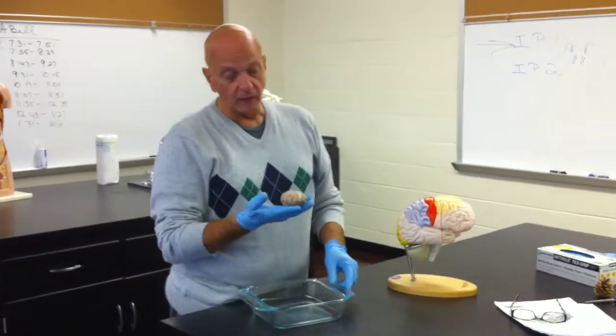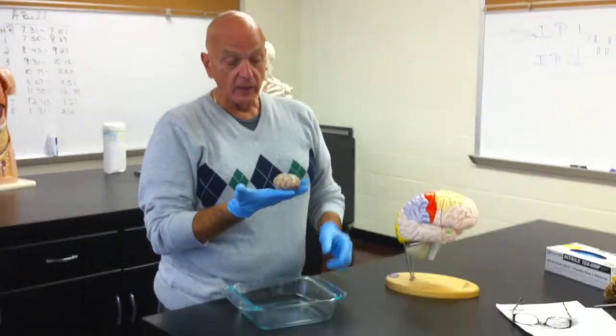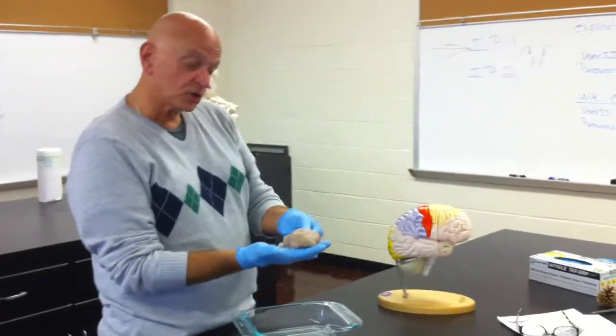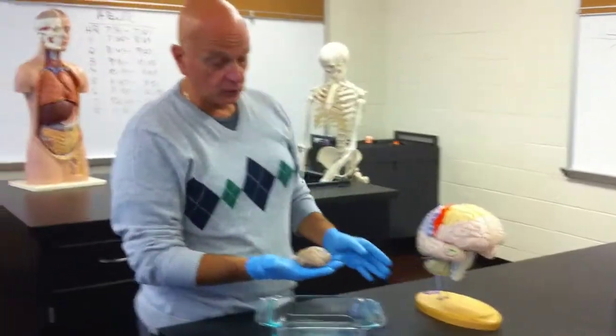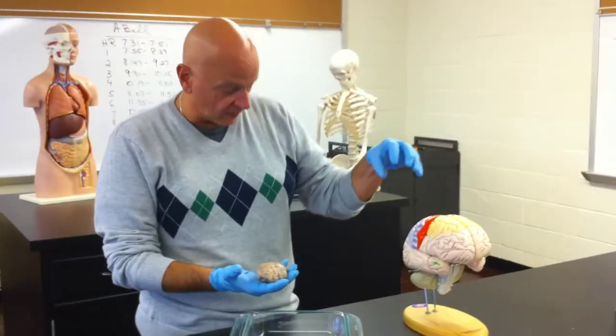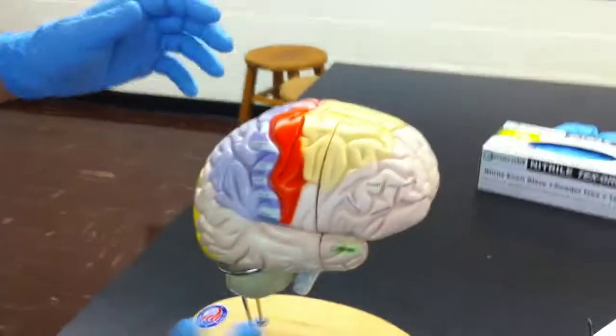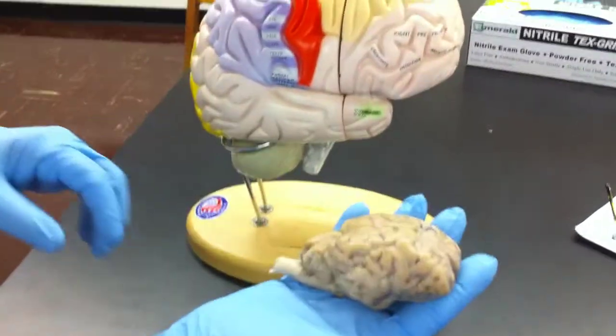Now what we're going to do, the other part of the sheep brain lab that we'd like you to do is to compare the sheep brain to the model of the human brain. Now remember that this is much larger than a normal human brain, but still you can compare the structures.